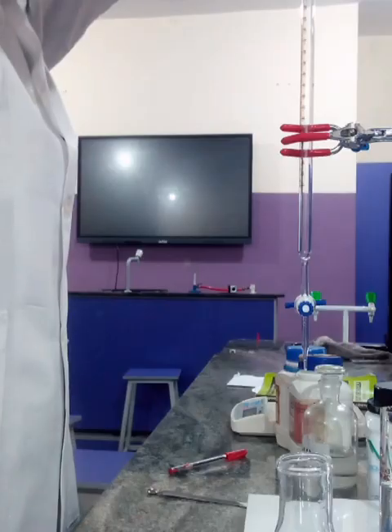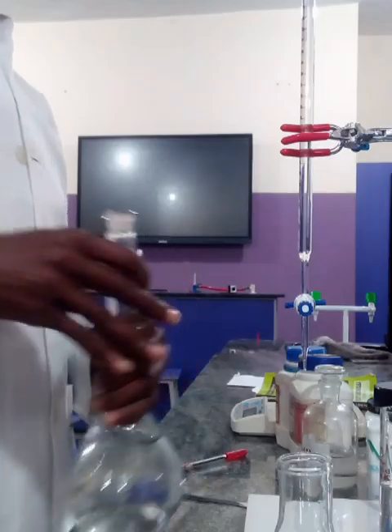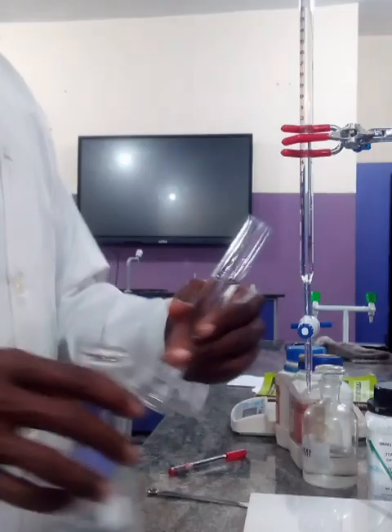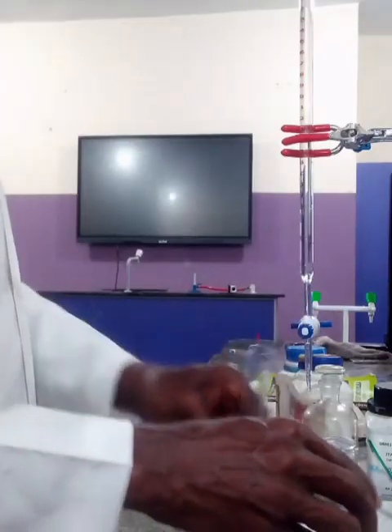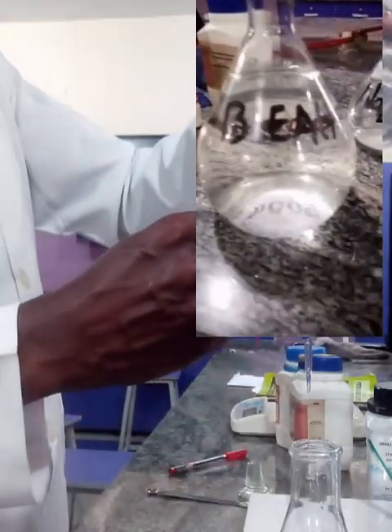Now to determine the concentration of the bleach, you need to take some amount of the commercial bleach, let's say 25 cm cube of that bleach, and dilute it to 1000 cm cube of solution using distilled water.